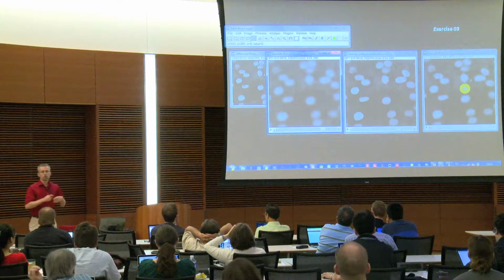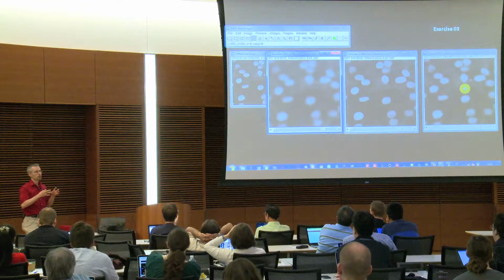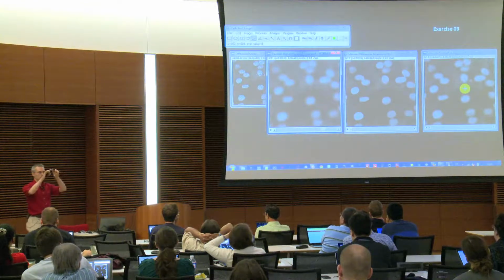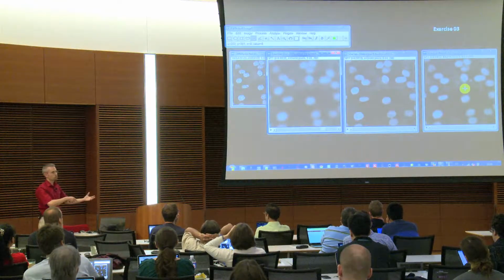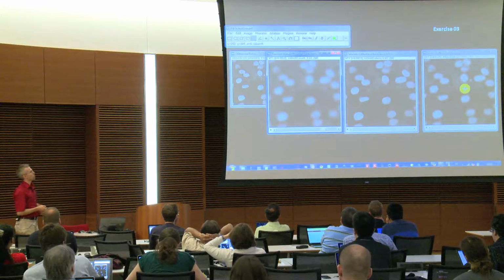But if your interest is actually you want to extract objects of interest in a way that you later on want to measure them by size or anything, or you want to use them to create ROIs from their outline to transfer it to a different image, then obviously that is counterproductive because the extraction will be either smaller or bigger. I can show you that later on.